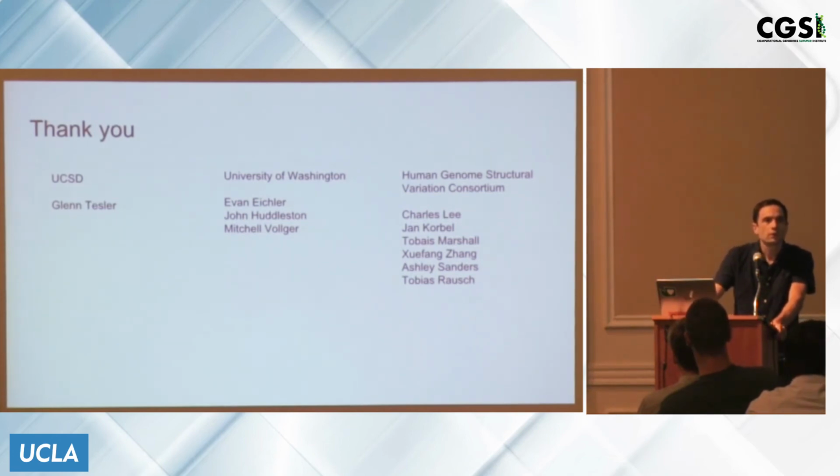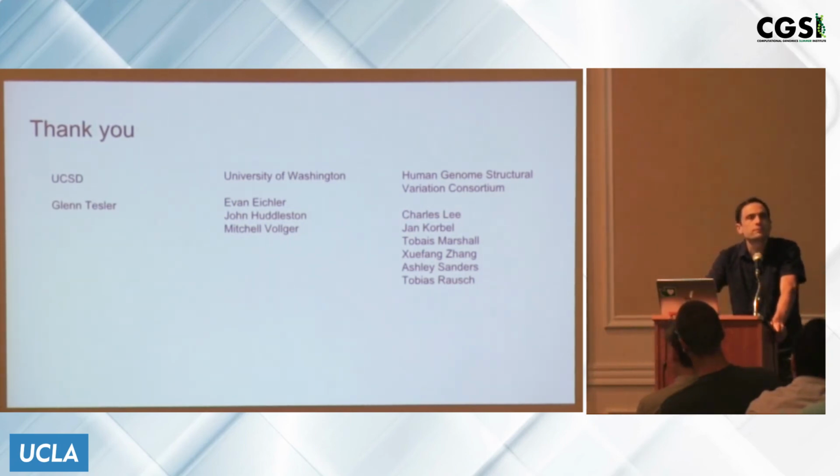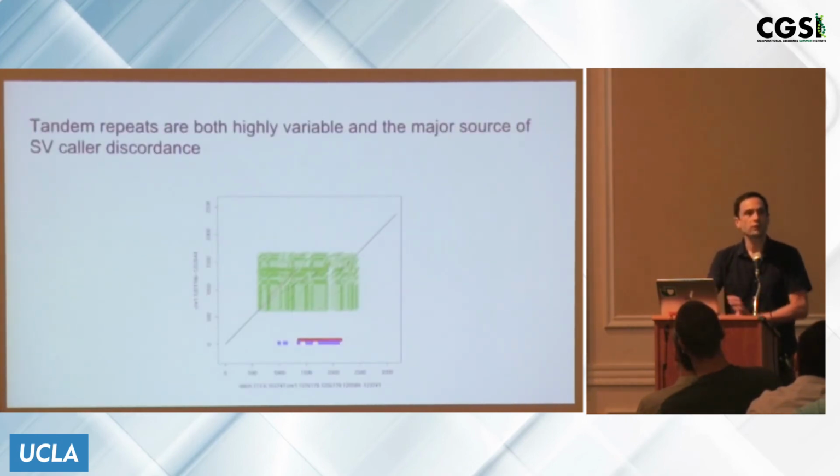I'm wondering, we published this method called Colormap for correcting PacBio reads with Illumina reads in a blind way. We never really thought whether it makes sense to do that and then call structural variants, or whether the integrated analysis through comparing the structural variation calls makes sense. Is there a principled way to think about what is the right approach? So I think it makes sense until you get to some of the really difficult regions where the mapping starts to get very ambiguous. It's definitely a principled approach for much of the genome, but it becomes somewhat difficult in other parts of the genome.